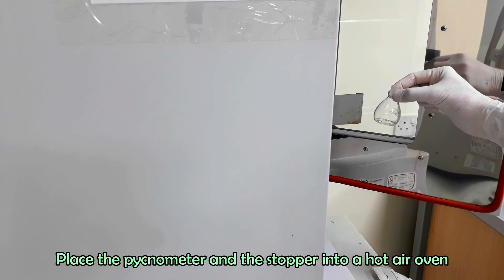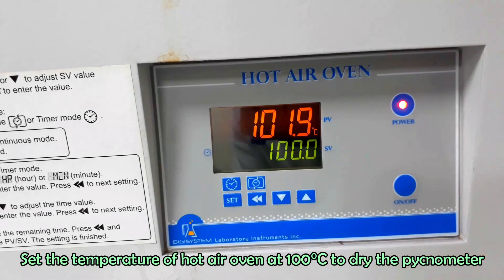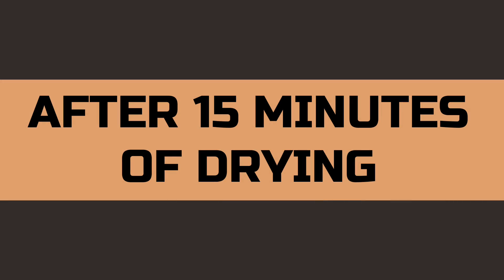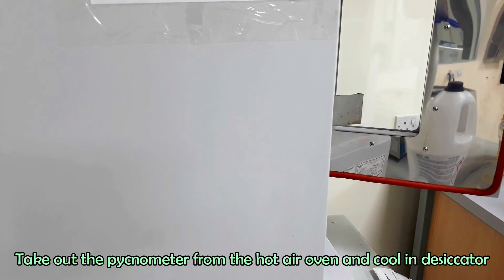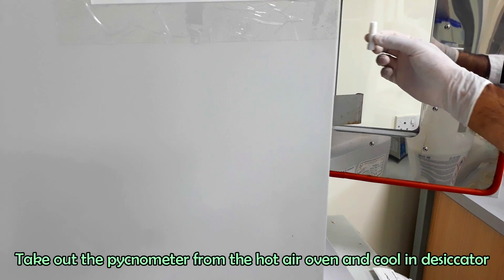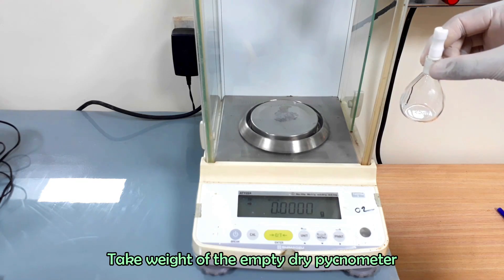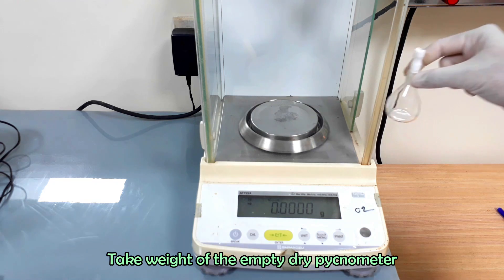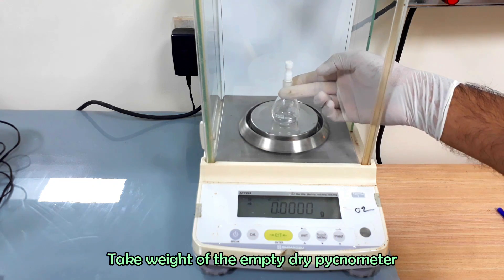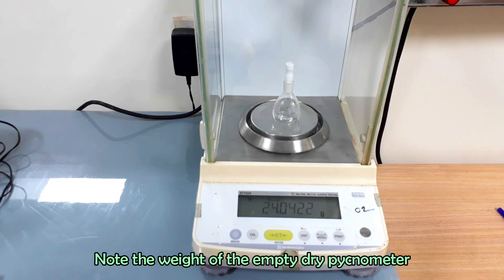Now dry the pycnometer in a hot air oven at 100 degrees Celsius for 15 minutes. After drying, cool the pycnometer. Take weight of the dry empty pycnometer and note the weight.